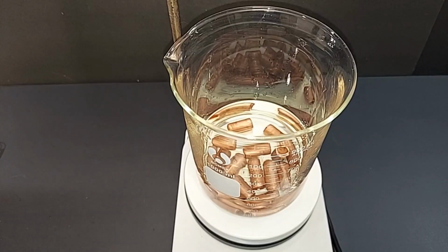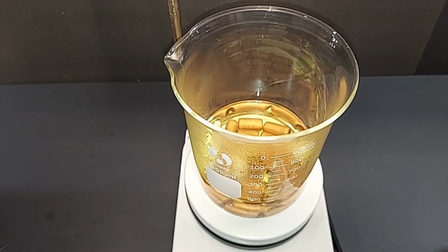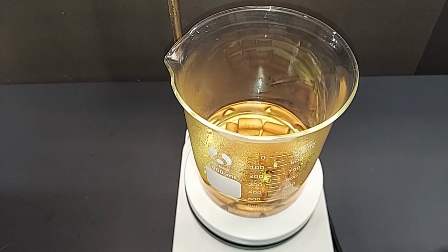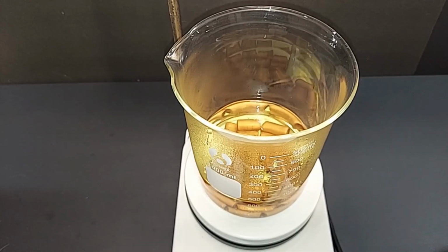I'm going to heat the solution to approximately 40 degrees Celsius and then slowly add the hydrogen peroxide. It's taken a half hour with gentle heating to get this to 40 degrees Celsius. You can see some small bubbles on the copper, so at this temperature the hydrochloric acid will work on it in small amounts, but we really need the hydrogen peroxide to make this go forward. I have been using the magnetic stir, and I'll turn it on briefly here. It's not really working, but it is bouncing around, just helping the solution to get mixed about. So that's about all it's probably going to be worth until it is almost all dissolved. I'm not talking about the copper here. So let's add our hydrogen peroxide.